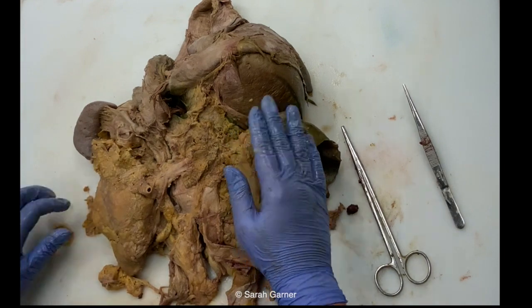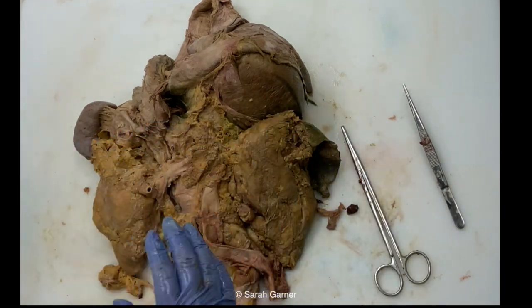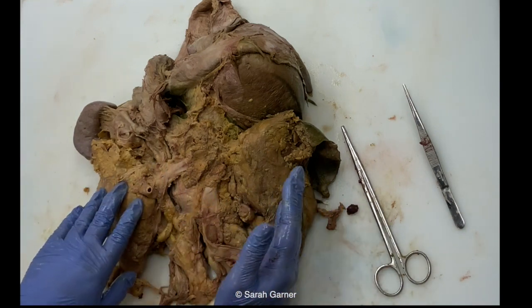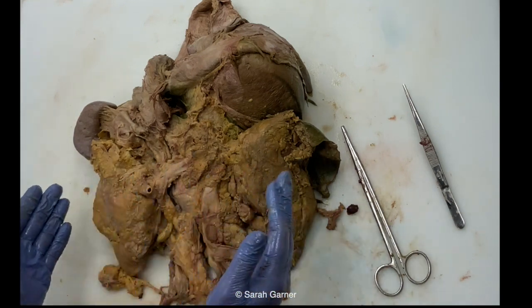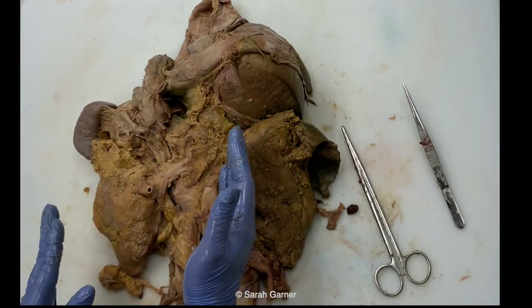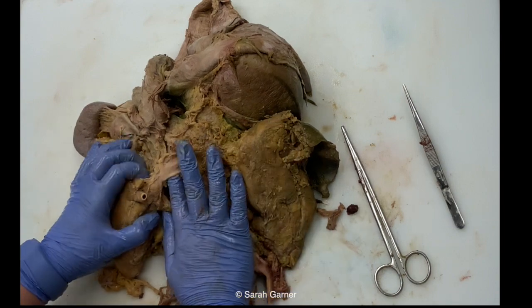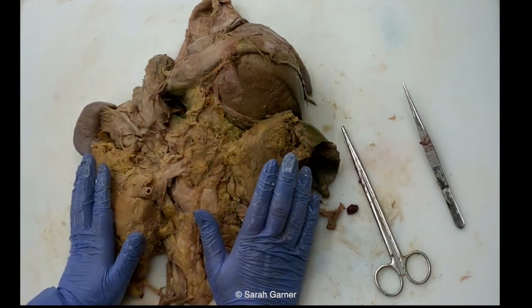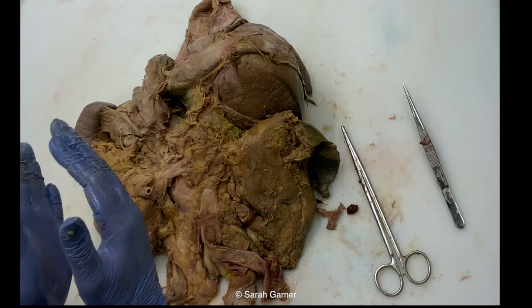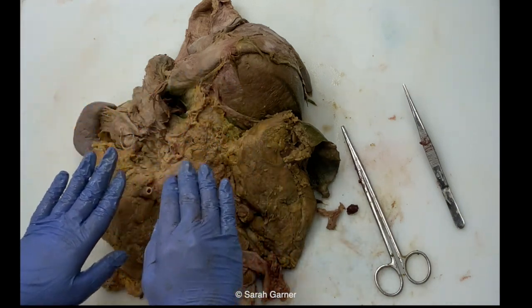Now, in my opinion, the order doesn't really matter. Do whatever feels right, do whatever is the easiest to get to at that point, because each case is going to be a little bit different. Maybe you have a huge liver that's really in the way, and so you want to do that first. Whatever, as long as you find those adrenals first, I feel like that's a good first step. And then everything else, as long as you're doing the sectioning and the separation that you need to do, the order doesn't necessarily matter, okay?